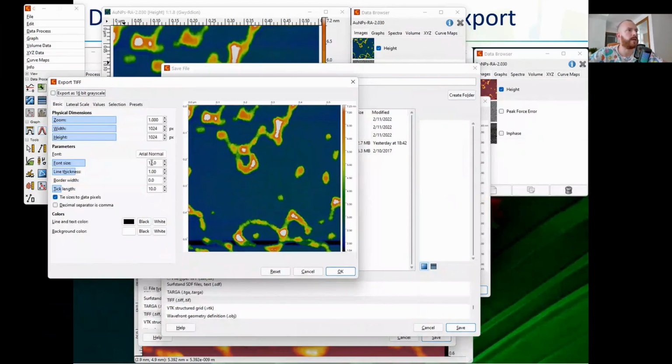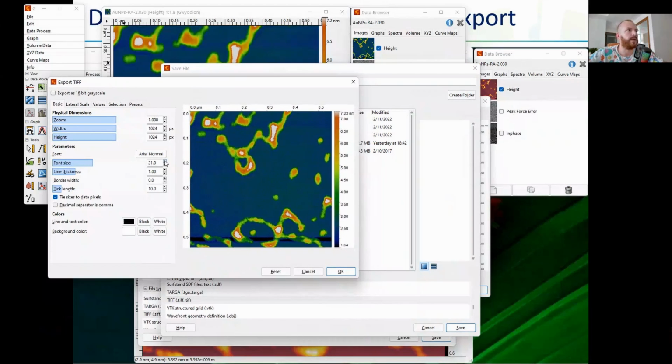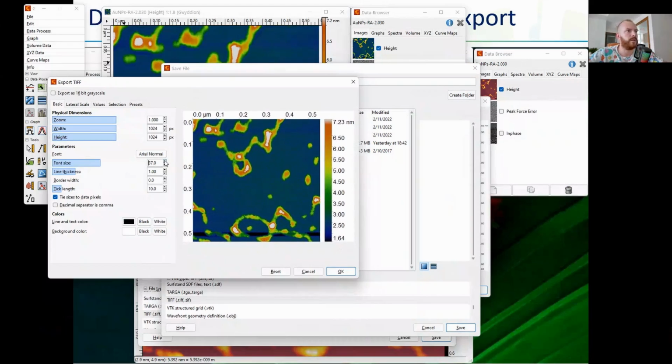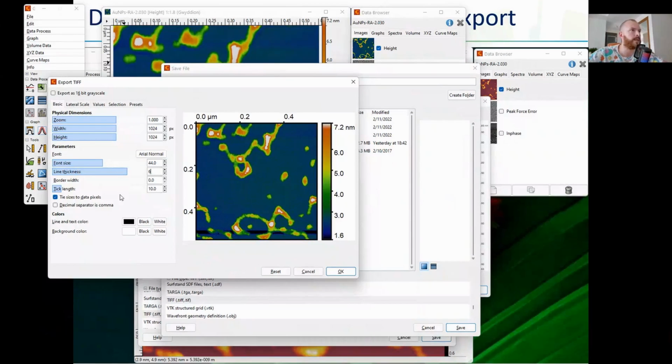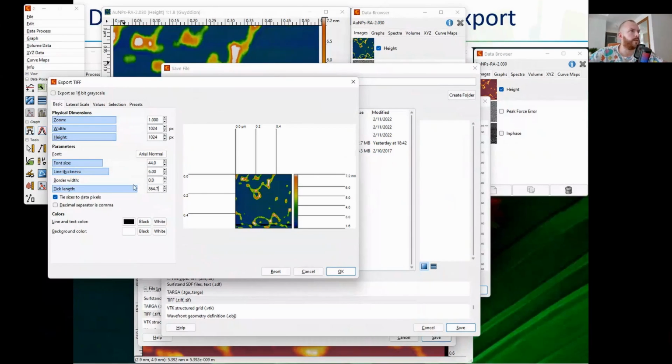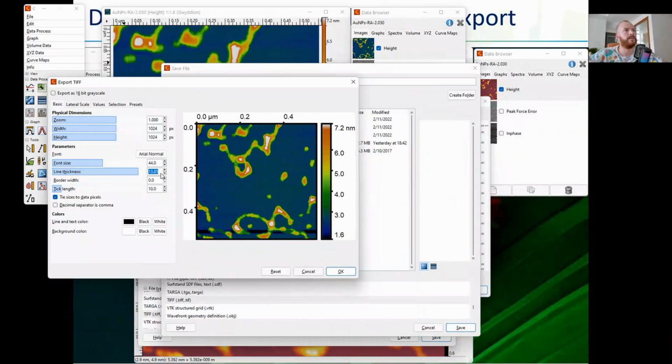Again, I can do some, for example, if I need really good representation of my data, maybe I want to do it like this. Maybe I want to increase some line widths like this, not too much, maybe 6. This one is too much again, maybe 10. Yeah, more or less good data, I hope. Yeah, like this. This is already good treated data that you can place in any report.